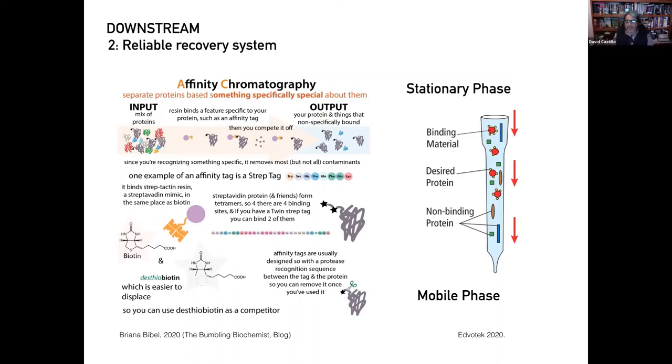your protein. That's sometimes not so easy for certain proteins, and this is where automation comes in handy. So the mixers, and the buffer mixer, are going to help us generate the gradient in order to wash the proteins. And you don't have to be stuck directly at the column, watching when the buffer is coming, and so on and so forth.